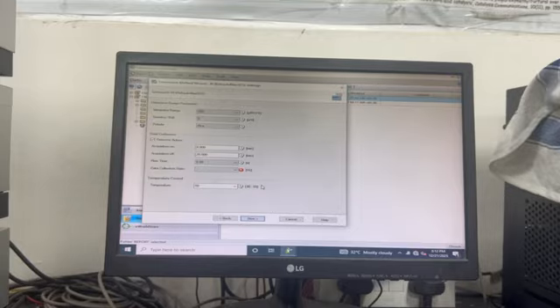Then next is my RI detector. For the RI detector we generally don't touch anything, so I can give it maybe 5 Hertz as the collection rate. RI is generally best for sugars, because sugars have low UV absorbance, so RI gives good detection and runs in parallel. It's better to use it in parallel, so that's why we are setting it. We can play with it also, and you can see the information in papers.